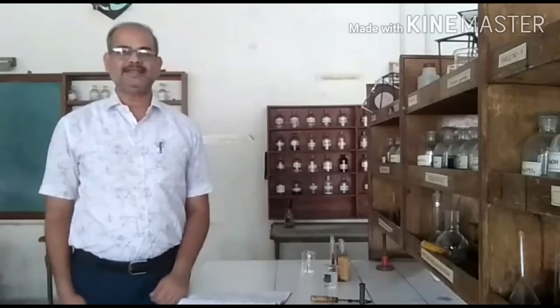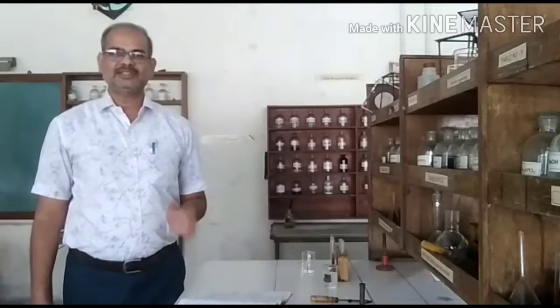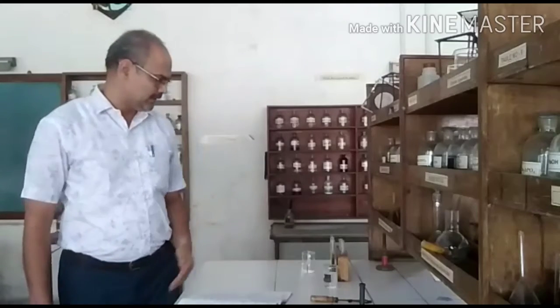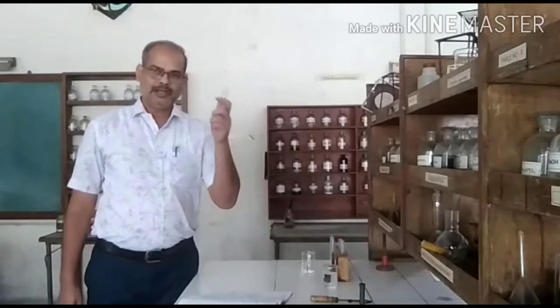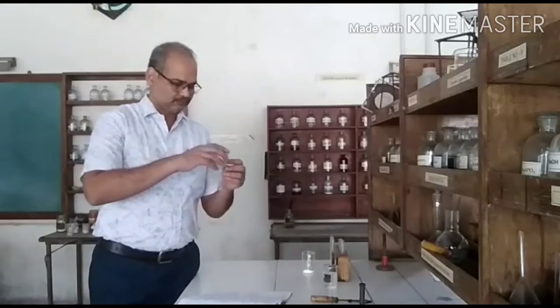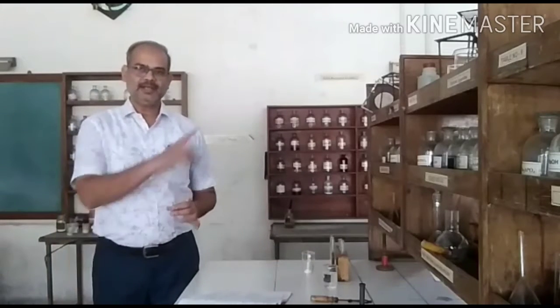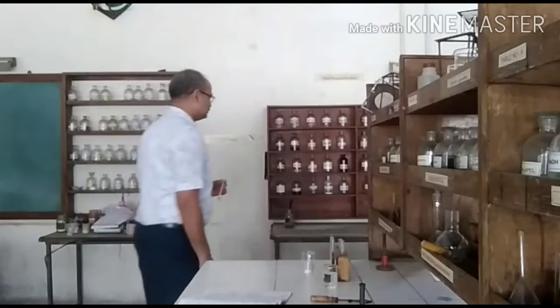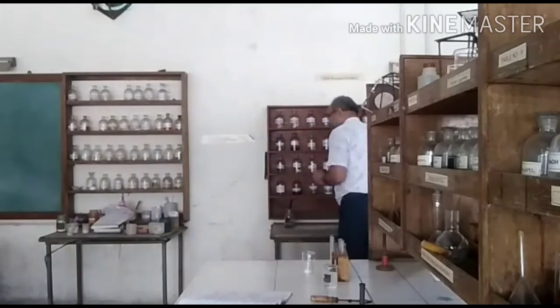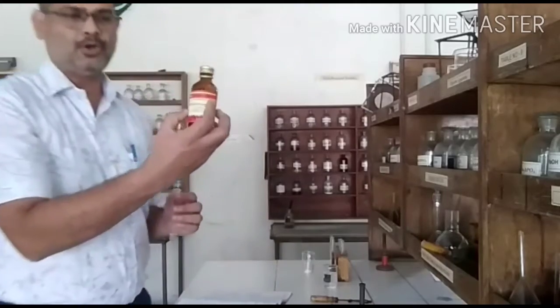Now when you physically see the pink color, you see it very nicely. But through the video it will be a bit difficult for you to check the pink color. So I will compare that pink color with some colorless solution so that you will understand. So take a clean test tube, take little OS in it and add phenolphthalein 2 to 3 drops. Where is phenolphthalein? It is again on the side rack. So this is a small bottle of phenolphthalein. It's written on the bottle.